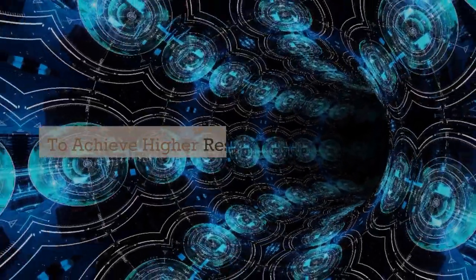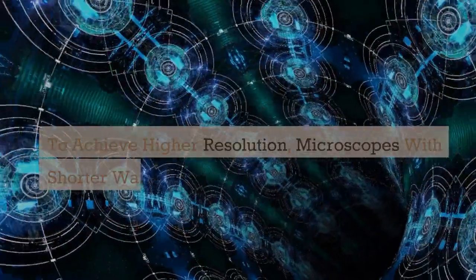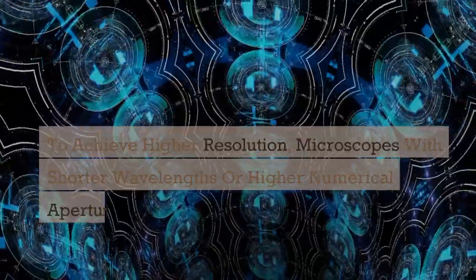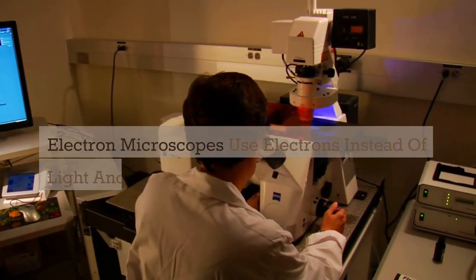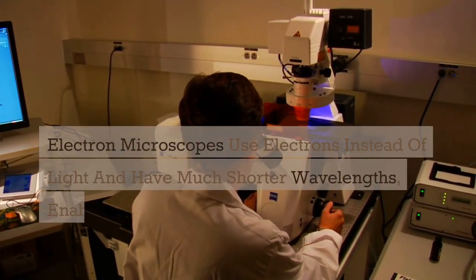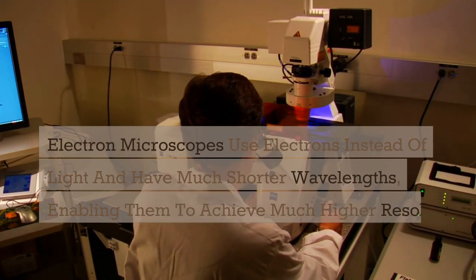To achieve higher resolution, microscopes with shorter wavelengths or higher numerical apertures can be used. Electron microscopes use electrons instead of light and have much shorter wavelengths, enabling them to achieve much higher resolution.